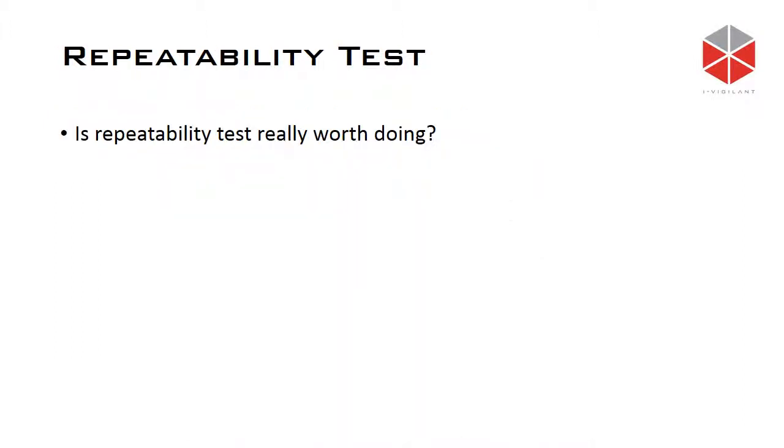So my question is, is it really worth doing? Because the GC can actually perform so much better than the actual tolerance that we've been using. How can it go wrong in terms of repeatability tests? There are a few things that can go wrong.